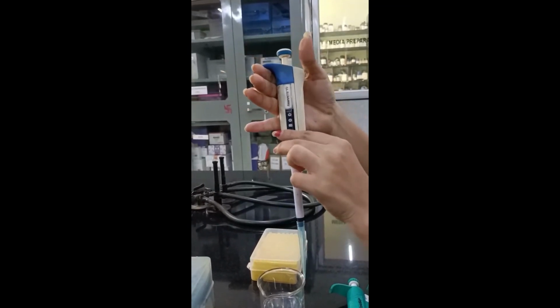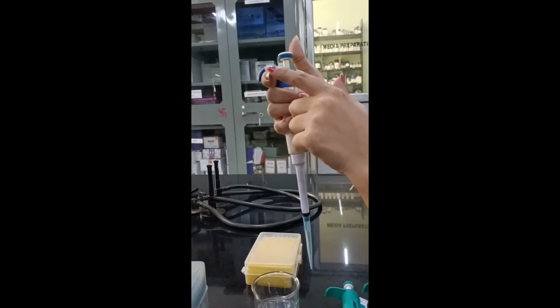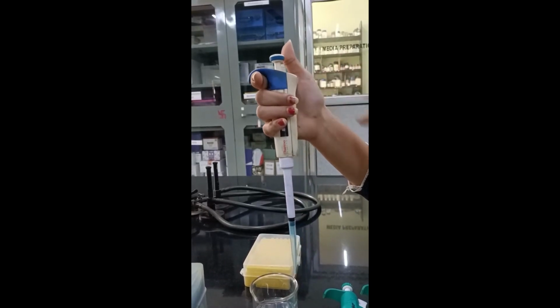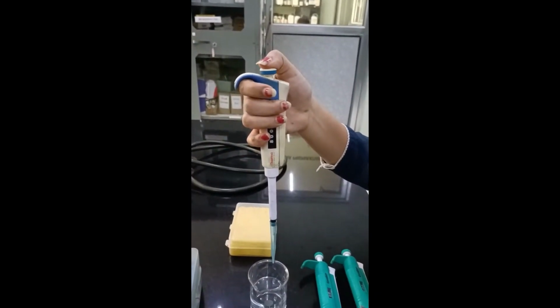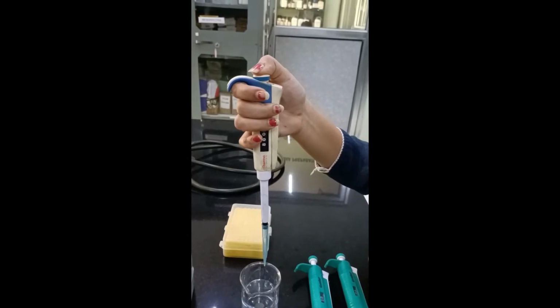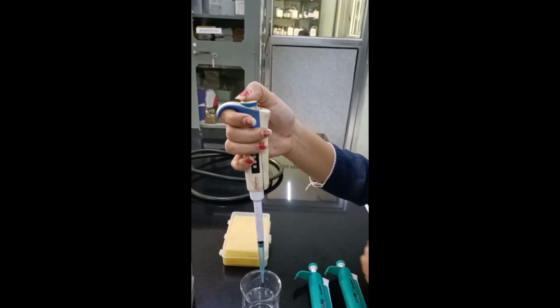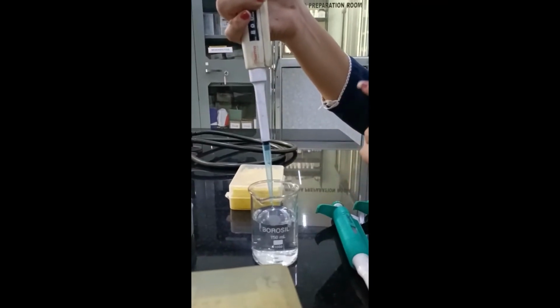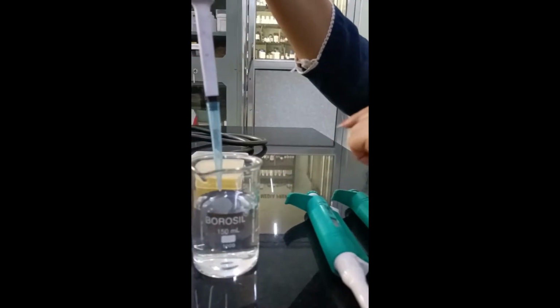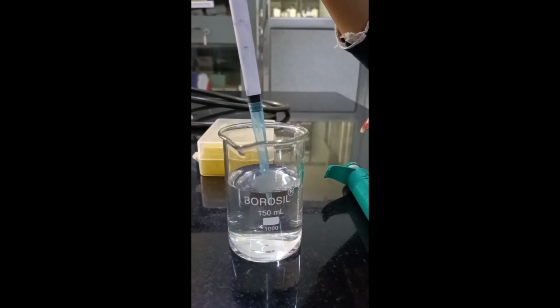We are going to hold the pipette in this particular way. Your four fingers should be lying over here, while your index finger is lying close towards this particular arm of the micropipette. To press this button, you are going to use your thumb. By applying pressure, you press this button, followed by that you dip your micro tip around 2 to 3 depth from the surface of the liquid, and then you are going to take up the solution.